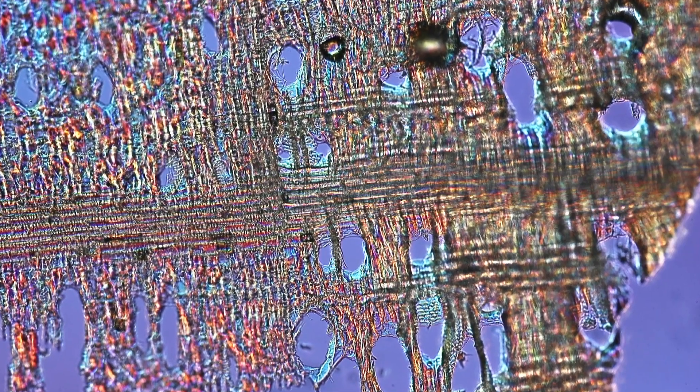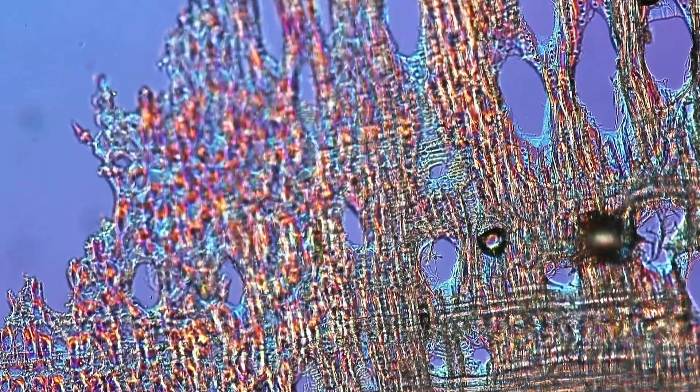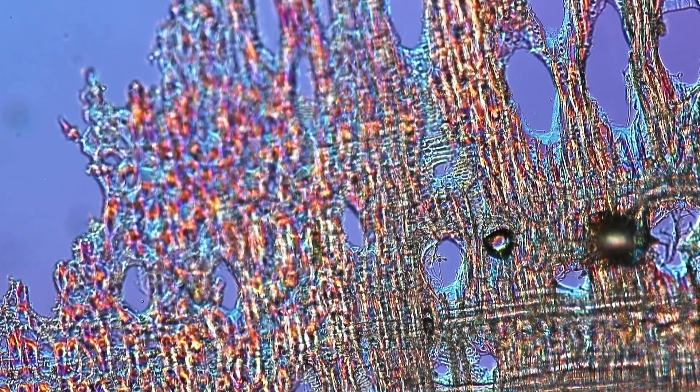But my point really here is that we are now able to see cells running crisscross into different directions. Now let's try a different cross section here, because this is now the longitudinal section. Let's try the cross section of the wood.